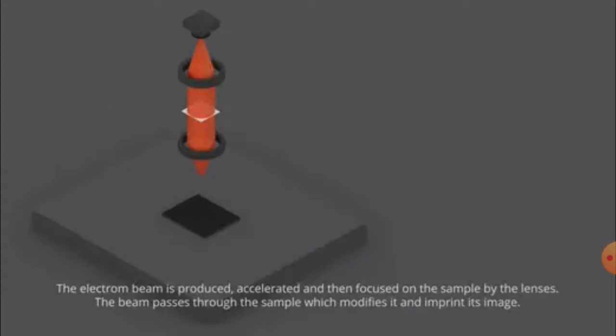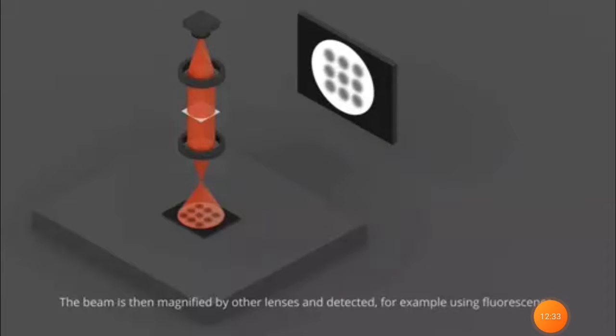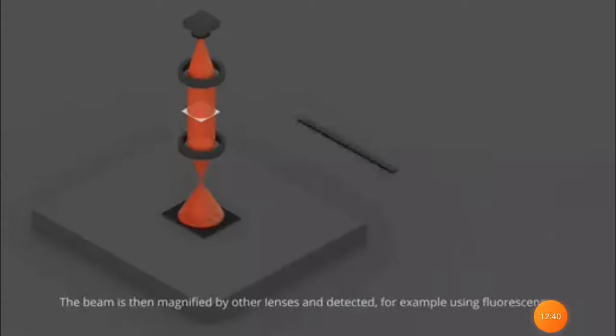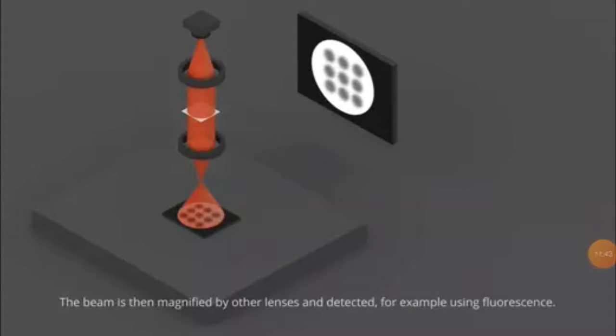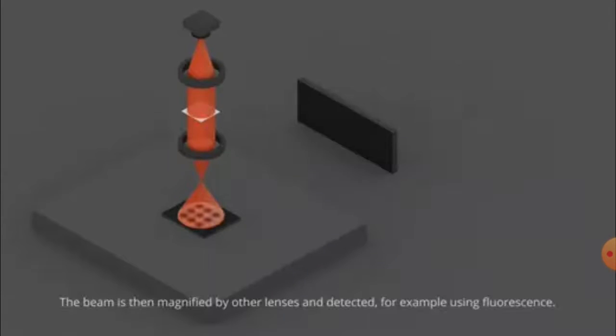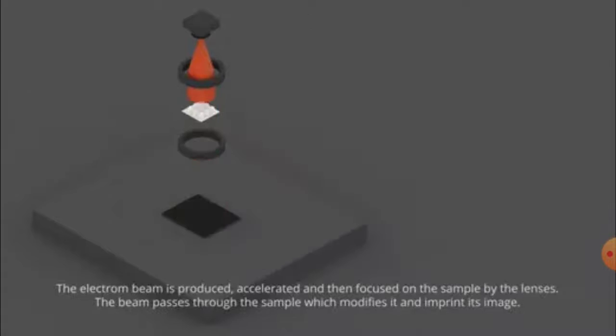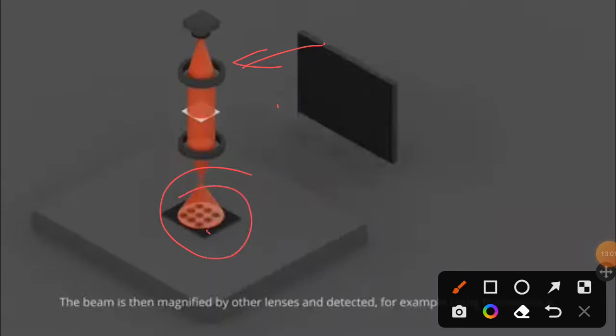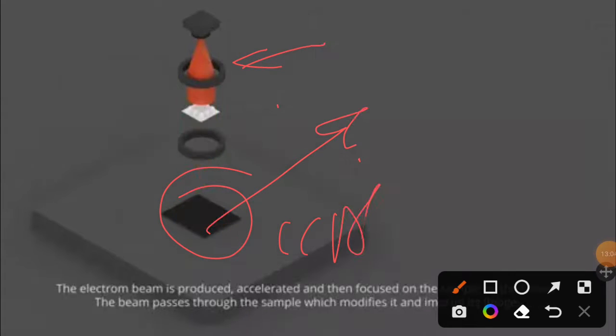So I hope now it is very clear to you, right? That transmission electron microscopy is nothing new. It is exactly the electron microscopy principle that we have discussed, and it was developed by Albert Prebus and James Hillier at the University of Toronto in 1938, and they used the same principle of Ernst Ruska and Max Knoll. Here they use an electron source, and from that electron source they create an image by using a CCD or photographic plate.